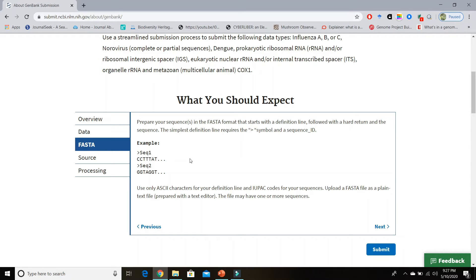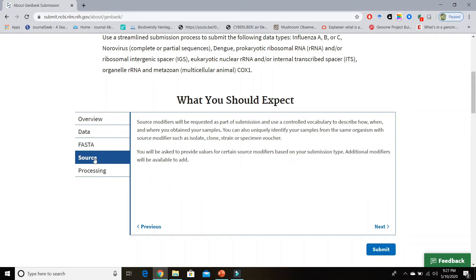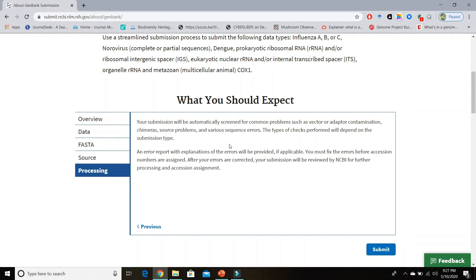In the FASTA section you can see how to make the FASTA file — an example is given to help you understand the FASTA file format. If you click on the Source button you will see more information about your submission of sequence data, such as isolate, clone, strain, or specimen voucher. Finally, in the Processing section, GenBank tells you how they process the sequence data — if there are some errors such as vector or adapter contamination or source problems, GenBank will correct these problems and then notify you about the submission process.